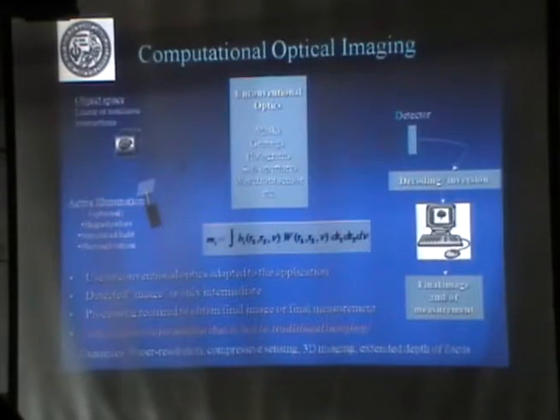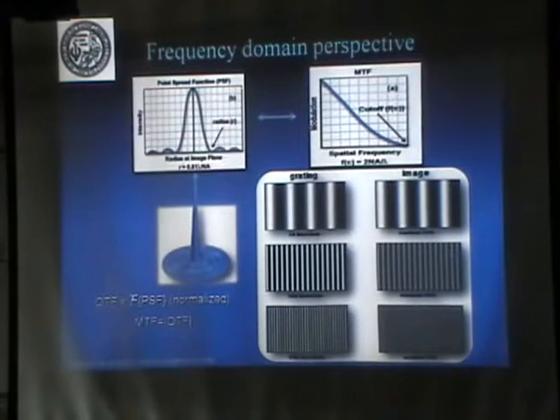Rafael: So going from the grating to the image, you're just assuming the grating is essentially a mask projecting the image? Yes. The grating is the object you're trying to see, and the image is what you see. Okay, and the decrease here is in contrast.